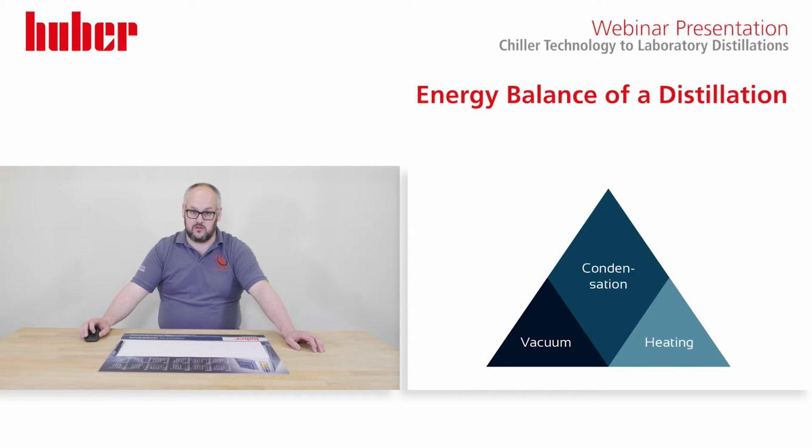When we look at a distillation, there's an energy balance here, and some people look at it like a triangle. For distillations, you apply heat to your distillate, and you also apply vacuum to reduce the boiling point. So you can reduce your boiling point, therefore, in theory, be able to distill at a lower temperature. Applying heat and vacuum are outside of the Huber remit for distillations, but the key critical component is the condensation. And we believe this is the most valuable parameter to play with.